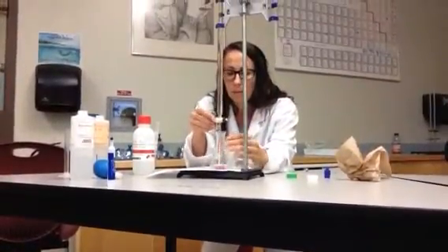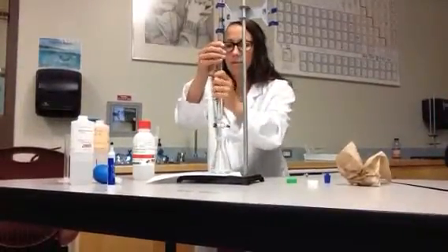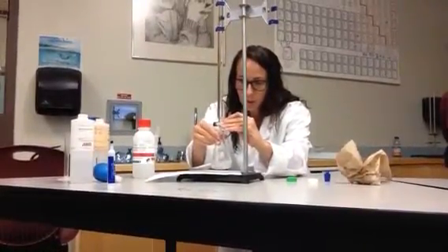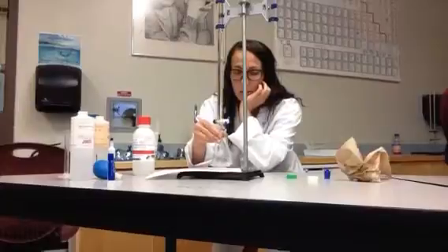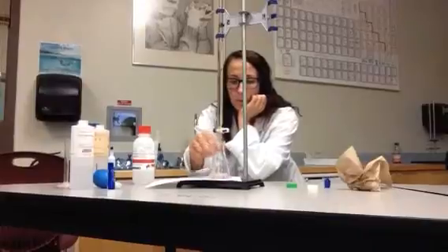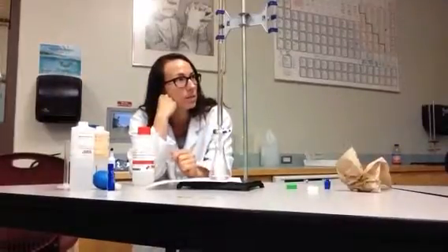So I'm going to keep going until 1 drop of base is going to turn my solution pink. So still excess acid, so still colorless. I can tell I'm getting close. There. And that's your perfect endpoint for a very light colored pink. Okay, so it is like a 1/4 of a drop too basic right now. But that 1/4 of a drop, I'm hoping, is after all my decimal places.